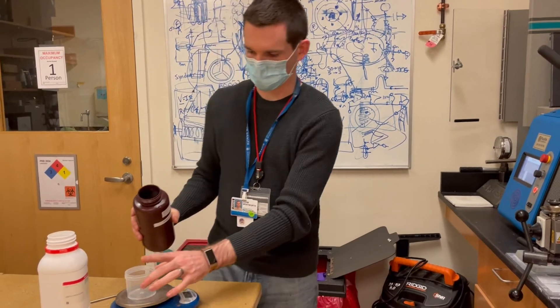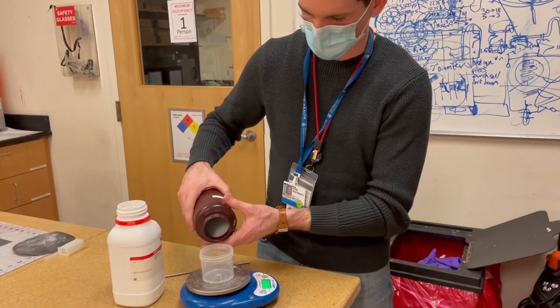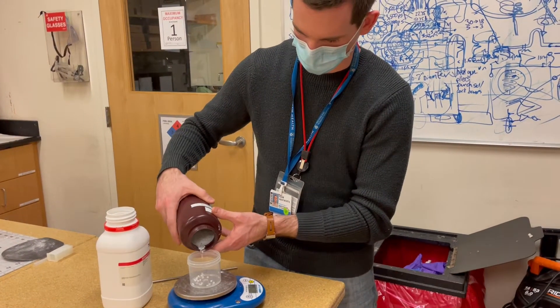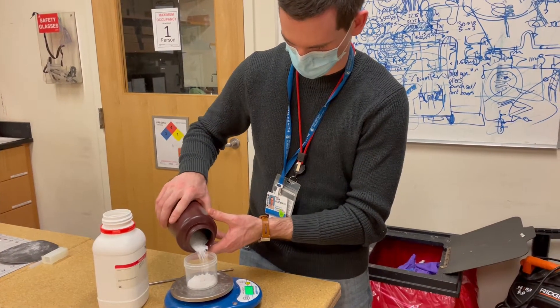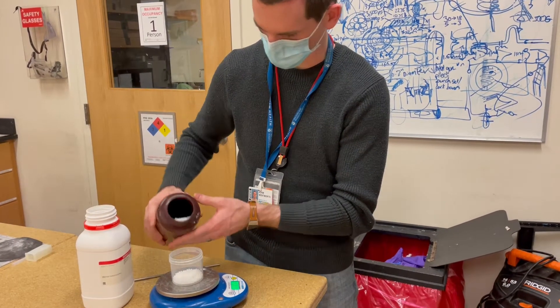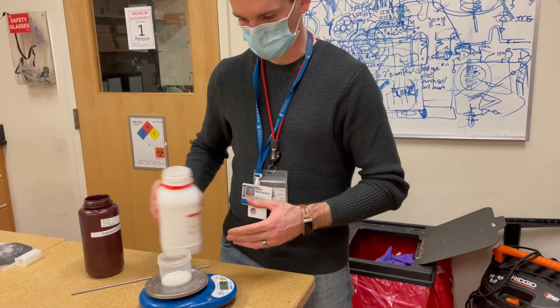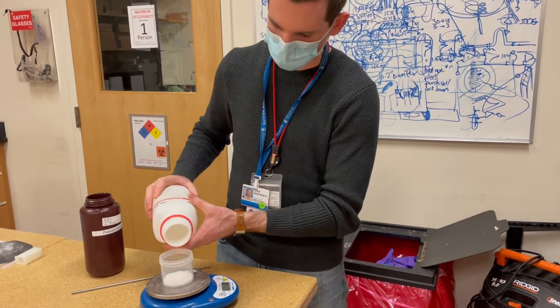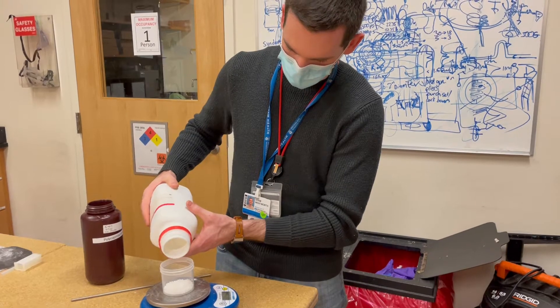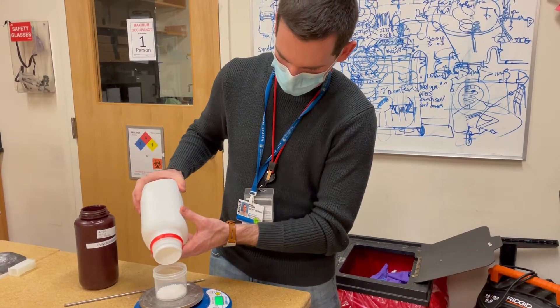We're going to take a cup that's pretty small and wide and weigh about 15 grams of each component into the cup. We got 15 and a half of barium sulfate — it's a high atomic number so it absorbs a lot of x-rays. And 15.6 of the other component.